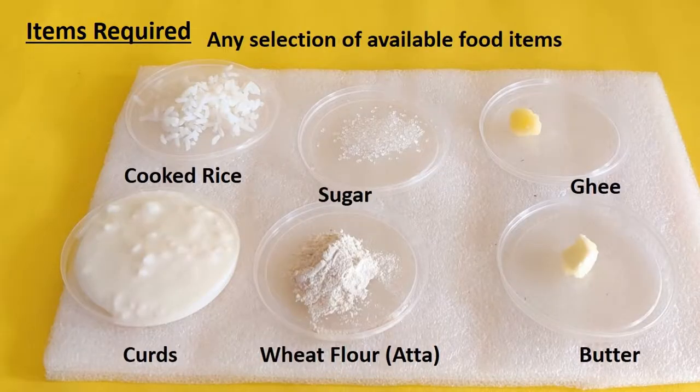To test the presence of starch, we will take any selection of available food items. Today we are testing cooked rice, sugar, ghee, milk curds, wheat flour or atta, and butter.